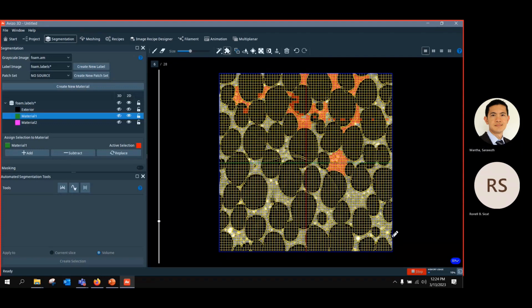So any questions so far on this? I think it's a really handy tool, and you can assign to the material that we did before. I know all these examples you can also do automatically using this general module, but it's something that maybe you can apply to your difficult data. Sometimes it will be a shape that you have to follow manually, and maybe this tool could be interesting in combination. Yes.